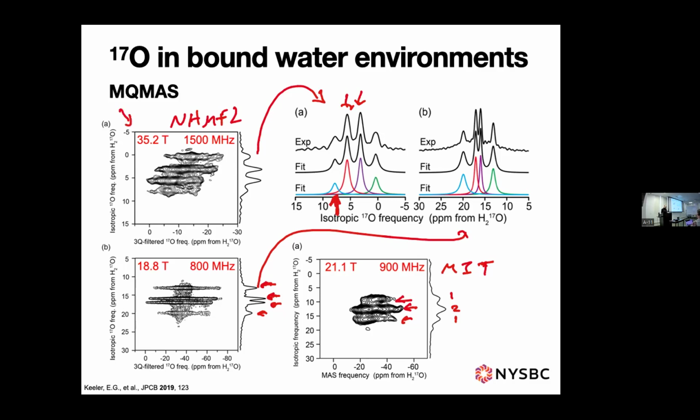this magnet can only be at field for 8 hours at a time. So the experiment has to happen in an 8-hour time period. Somebody has to be there with the magnet because it runs powered, so they have to flip it on, they have to get it to field, they have to let it stabilize, they can take spectra, then they have to turn it off. And you were talking about some vibrations yesterday also.